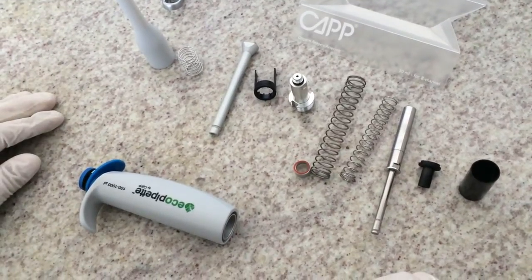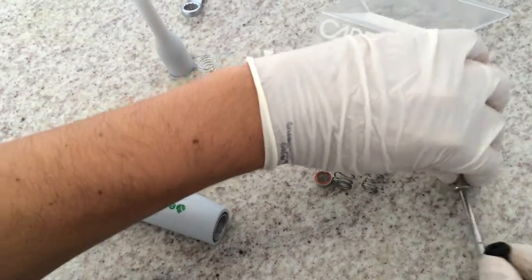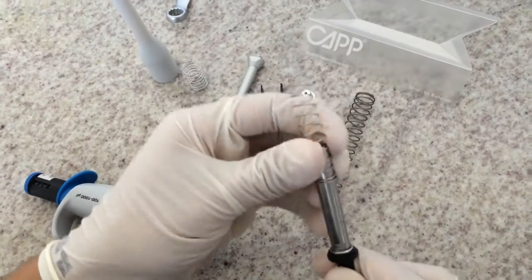Now we are going to assemble everything back. Place the isolation insert. Mount the pipetting and blowout spring on the piston.